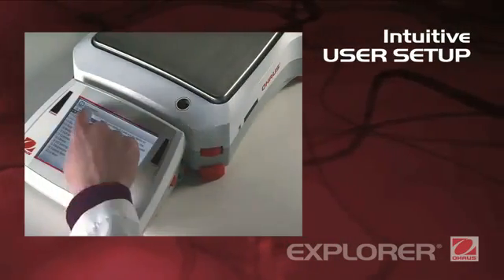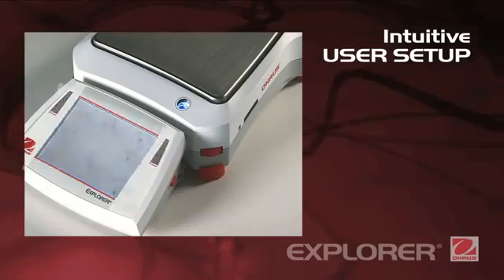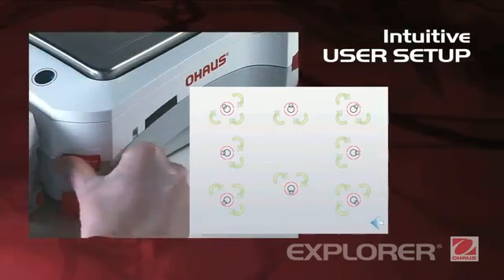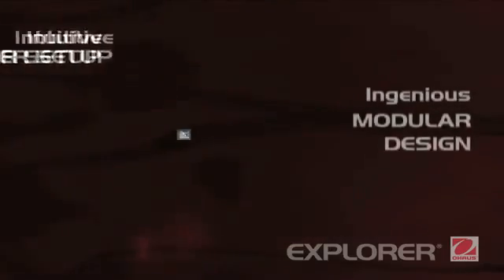Intuitive user setup. Explorer is the industry's most easy-to-use balance, featuring leveling assistance and instructional messaging for a quick, out-of-the-box setup and use.